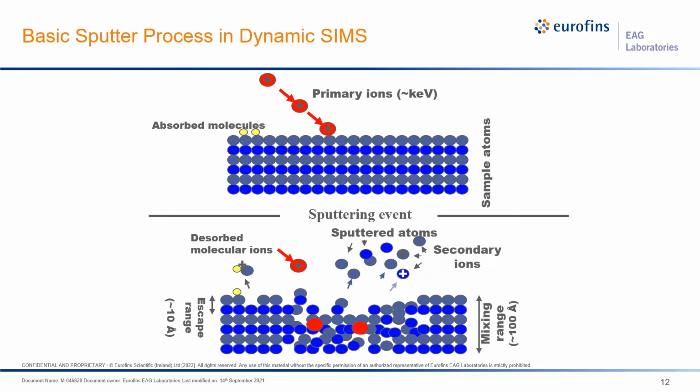So we can basically vary these parameters to achieve the analytical requirements. But because the lower kinetic energy is going to give us a higher detection limit or longer analytical time, we often end up analyzing samples in different ion beam conditions to be able to capture all the information that's necessary from a SIMS analysis.